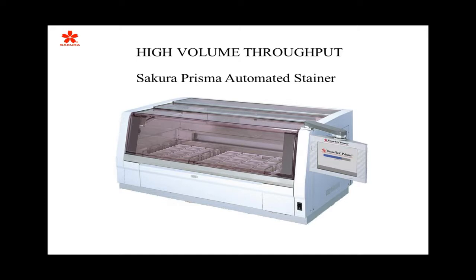This will give you an even higher volume throughput, but once again, you need to consider how often you need to make changes. So one key thing about this stainer, as opposed to the other stainer, is the rinse steps. Now, the rinse in this stainer here has a very, very good flush going through, as opposed to the other stainer, which has kind of a trickle of water.